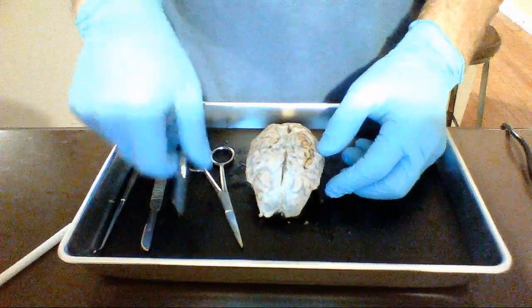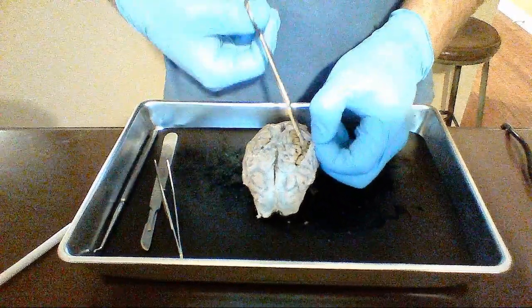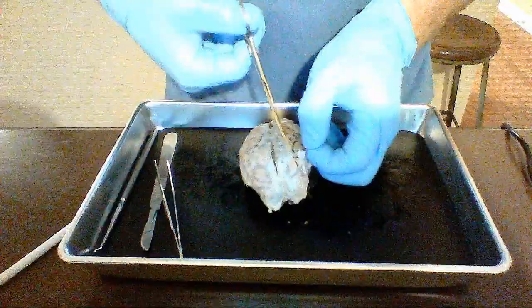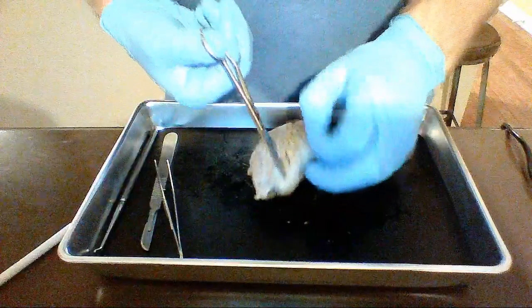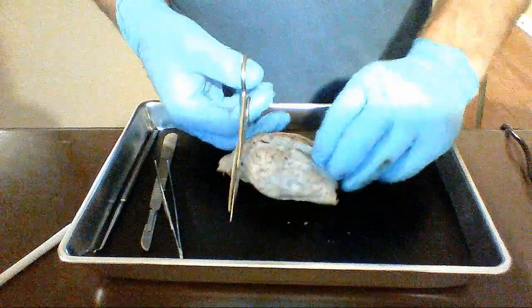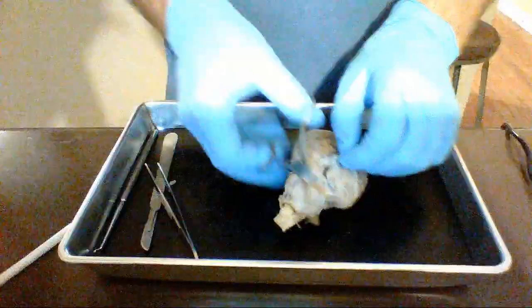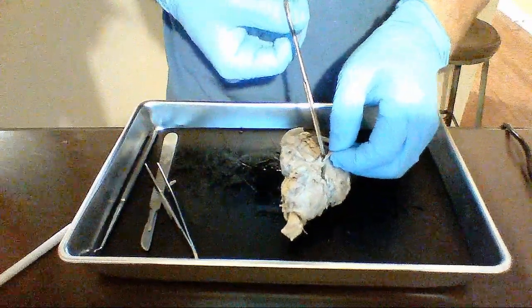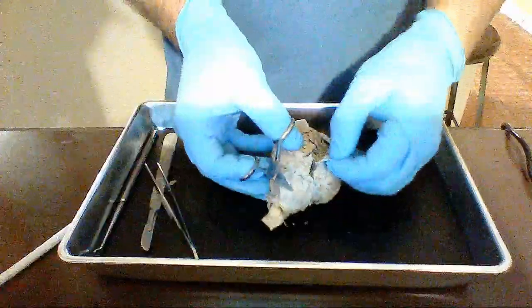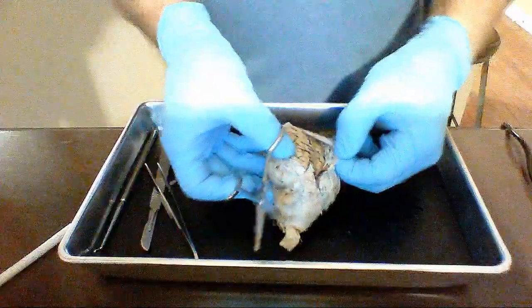So the first thing we're going to do is remove that dura mater. You have to be really careful, especially on the inferior portion, because a lot of important structures are attached, and you can easily remove what you might want to actually see. As you're removing that protective layer, you'll notice that it goes into this deep groove between the two cerebral hemispheres. That's called the longitudinal fissure. So you can see we're pulling it out there now. Your meninges go down into those deep grooves called fissures.